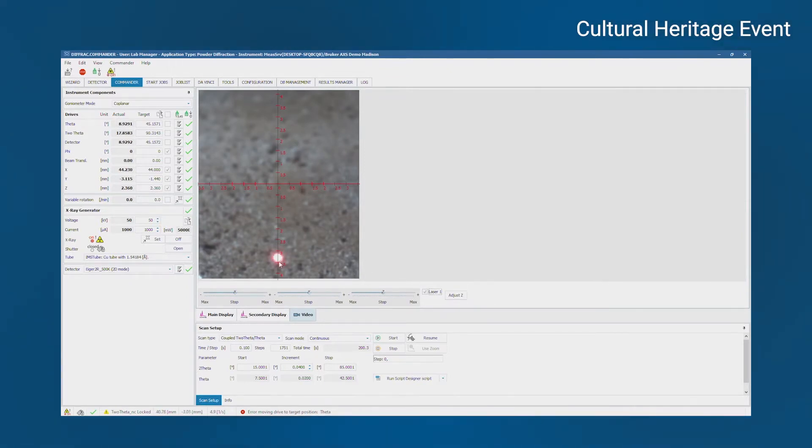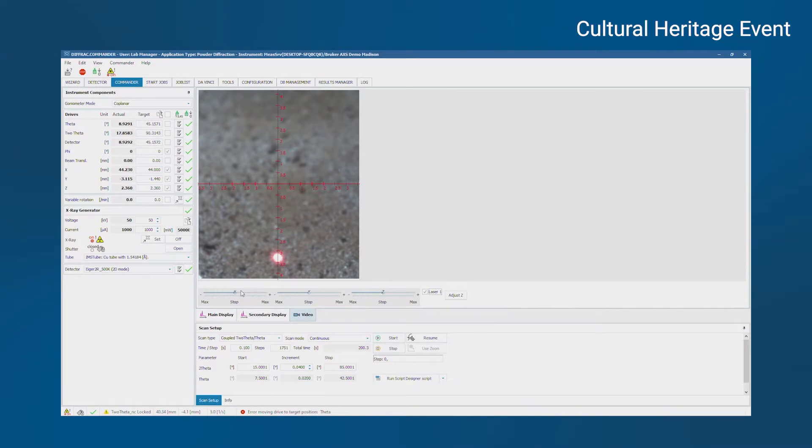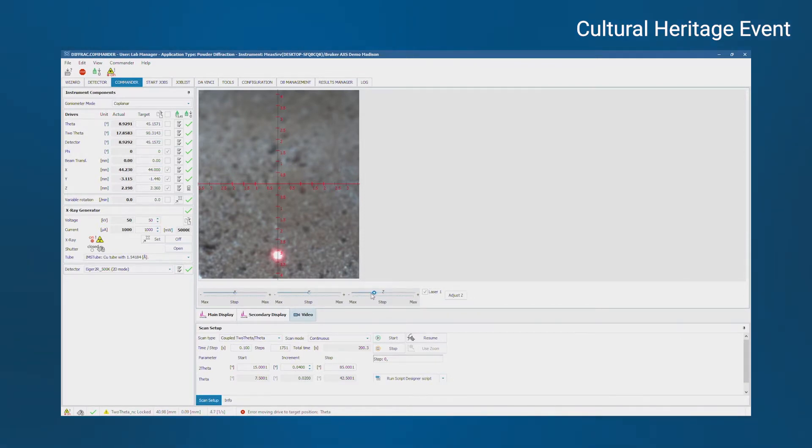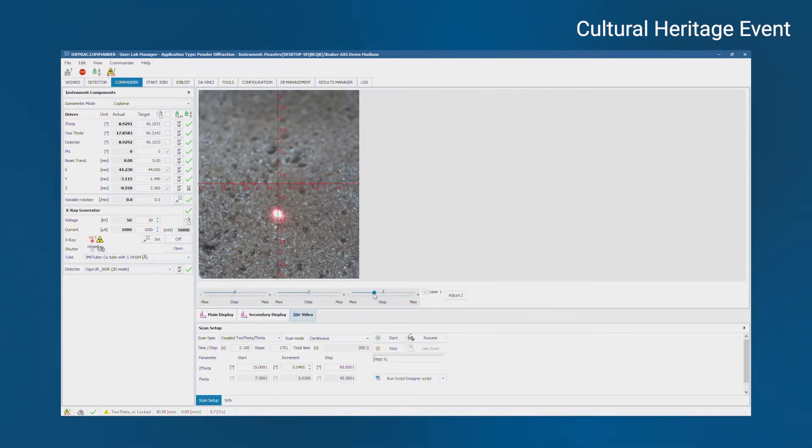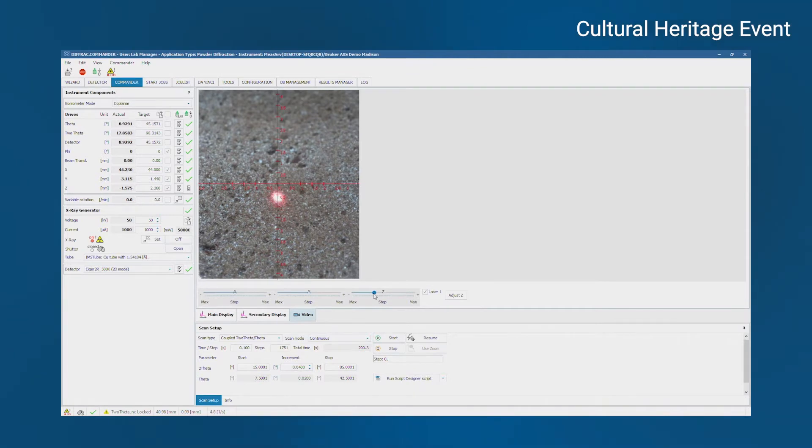Here we can turn on the laser, and to set the sample height, you need to adjust z position until the laser is in the center of the camera reticle. You can do that by typing it in or using the sliders. This is the z slider, and if I click and hold it, you can see that the image is getting more in focus and the laser is moving towards the center, which means that the sample is at the right height for measurement. And there it is.